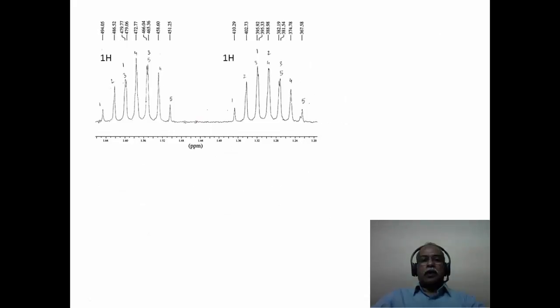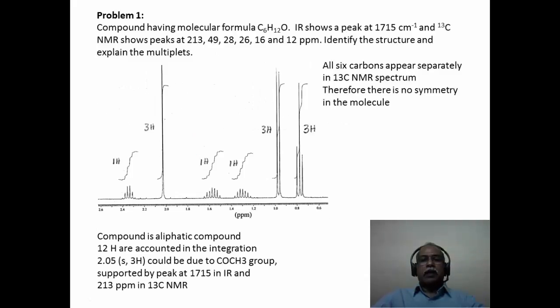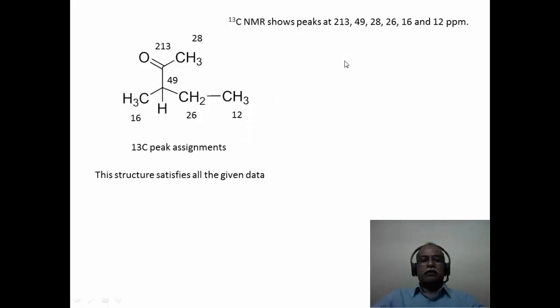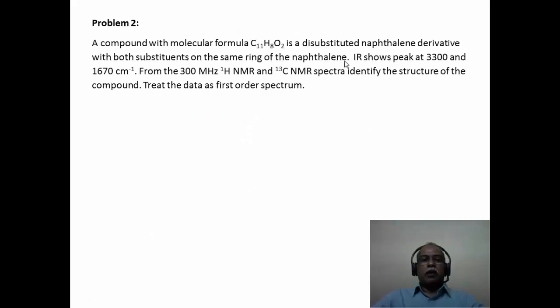Here of course one doesn't have the mass spectral data, only IR data and NMR data are given, and based on these two we are able to solve the structure of this molecule. Let us move on to problem number 2.